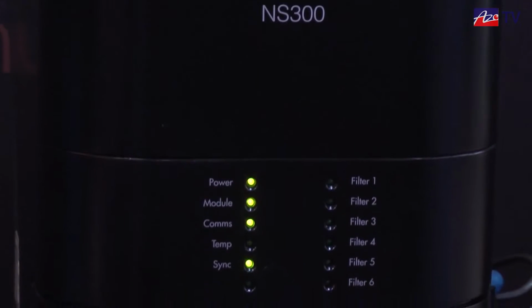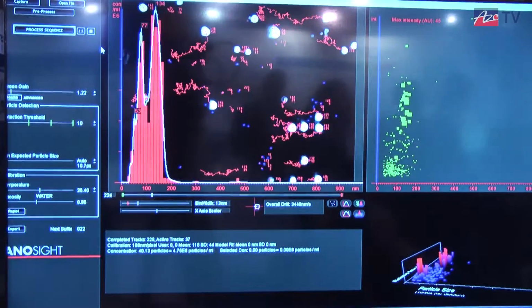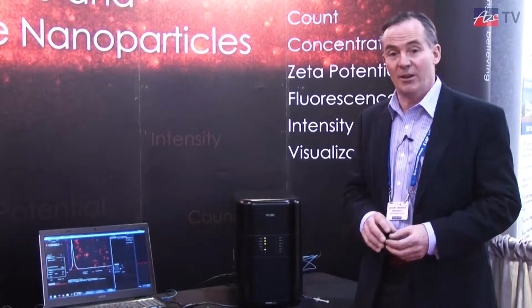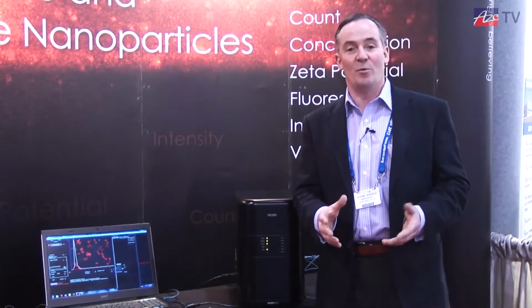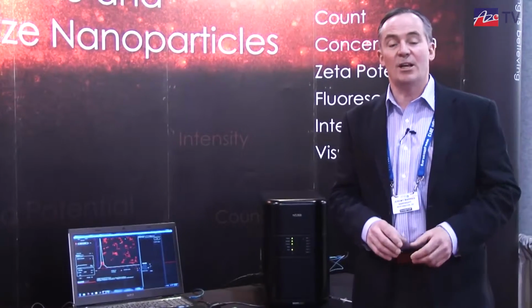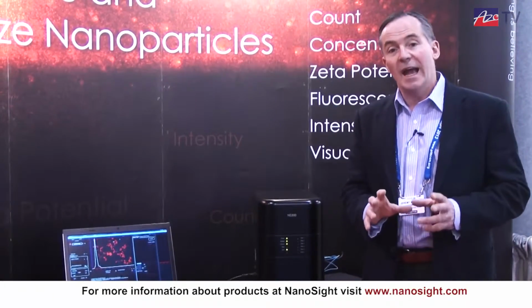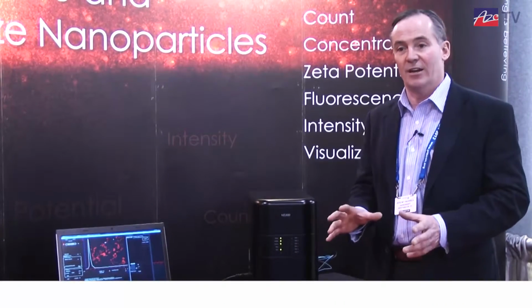In addition, we've included in the software a rheology function. Now, if you can use NanoSight to measure particle size because you know the viscosity and you know the temperature, then if you dose particles of a known size into the system, of course you can recover the missing variable, which is viscosity. So that's nanorheometry. It's specifically applicable to low viscosity systems, 1 to 5 centipoise, and we see an application for that in hydrogels. So that's part of the software of NanoSight going forwards.